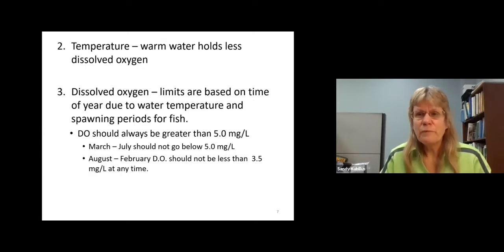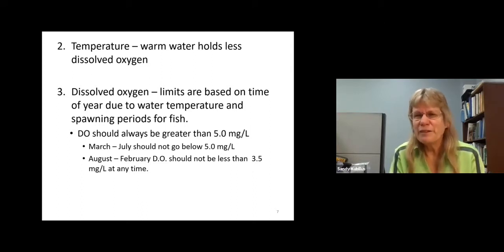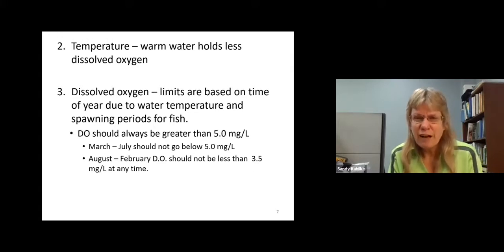And then temperature is a concern mostly for very warm water. Some lakes and ponds I've seen get up to about 30 degrees, which is like in the mid 80s. It's very warm for water around here. Our samples, though, have been sitting out in the lab for a while, so they are basically at room temperature, so that's not really going to be much of an effect. And dissolved oxygen, we already talked about it.